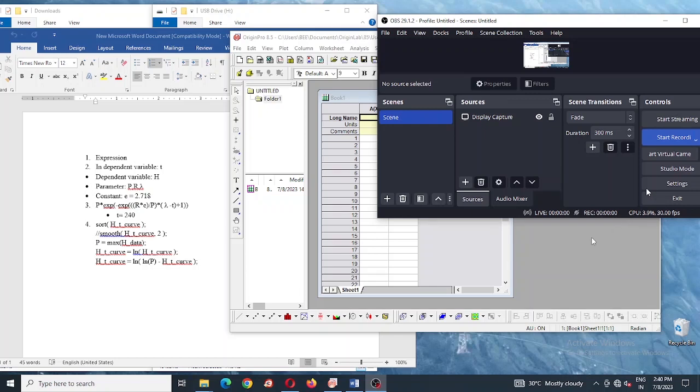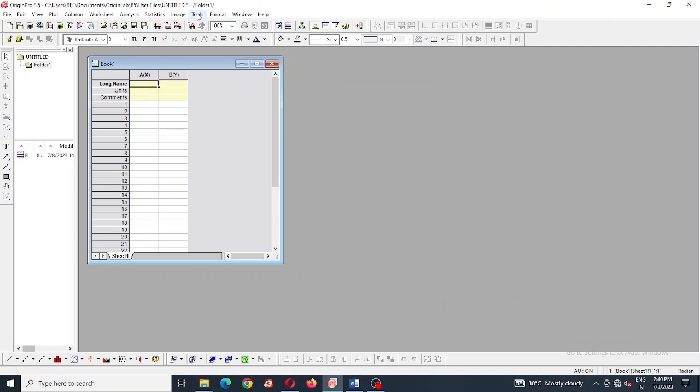Hello dear researchers, today I am going to show you how to create and use modified Gompertz equation.